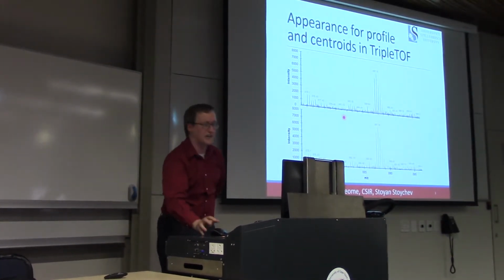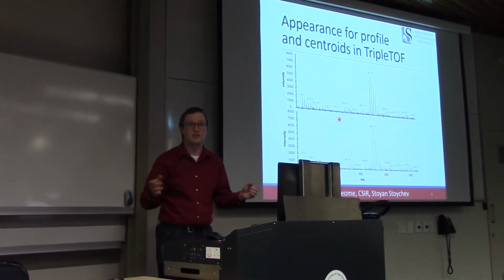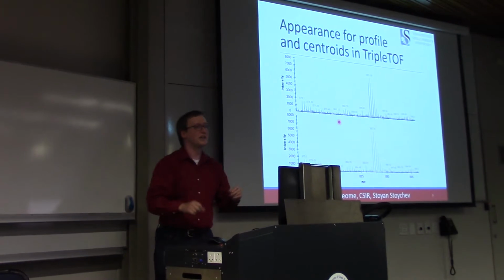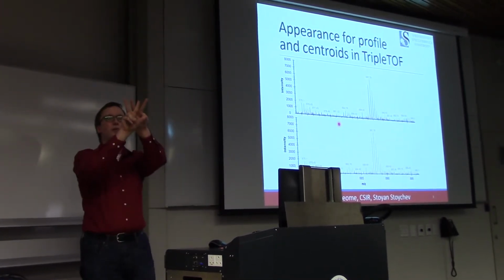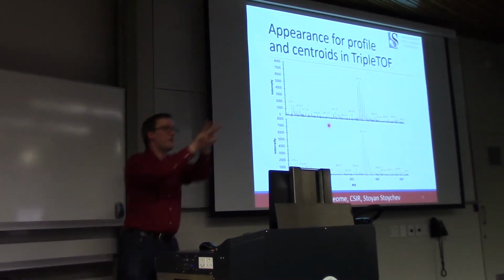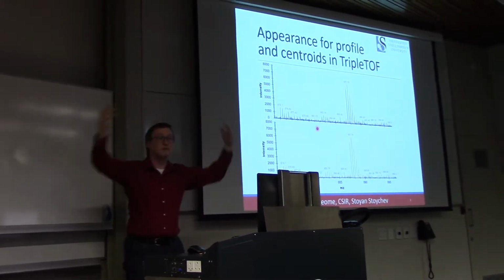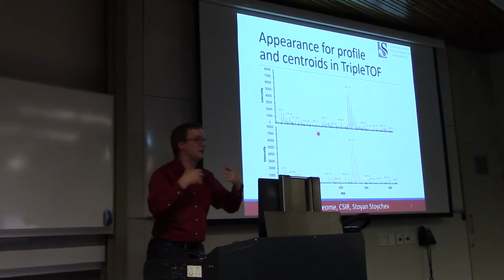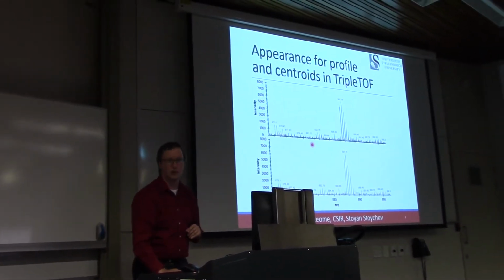And we also have other ions in here. Some of them are not 0.3 m/z apart from each other. They're 0.5 apart from each other. Those are +2s. Now, what does it look like if you have a pair of +2s that are 0.25 m/z apart from each other? It looks like a +4, but we're not going to worry about that so much. This is one of the problems that we have to deal with when we're thinking about the intact peptide ion mass spectrometry. Now, I'm going to move ahead to zoom in a little bit.